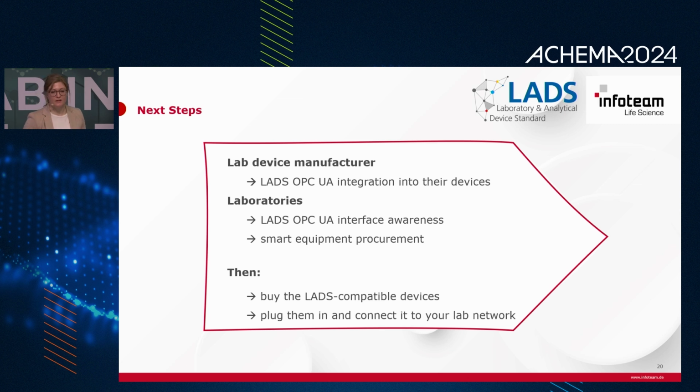So what are the next steps? First, the lab device manufacturers need to integrate LADS clients into their devices. By doing so, they empower labs with seamless connectivity, standardized interfaces, and enhanced functionality. For example, at the last LADS hackathon in Duisburg last month, we at infoteam helped a manufacturer to integrate a LADS client for a sensor device within 3 days. So it's not so complicated, and I think manufacturers are able to do this.